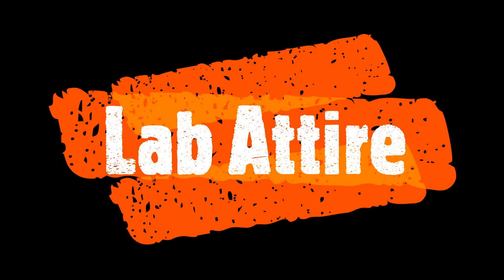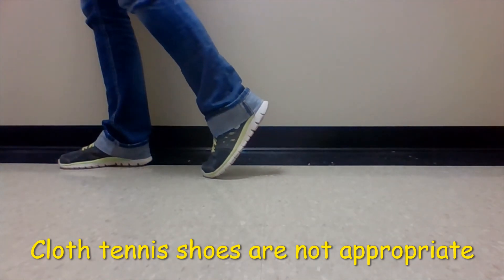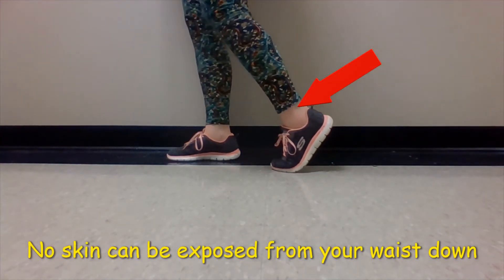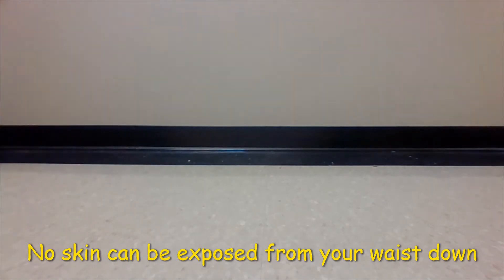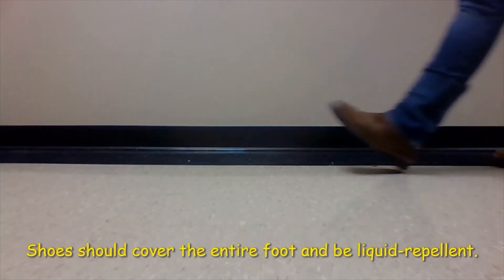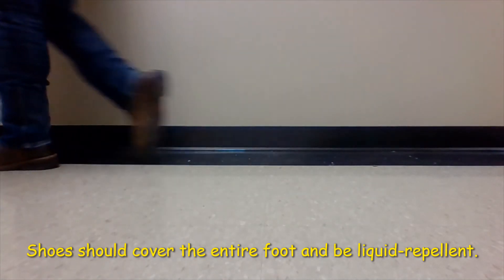Now let's talk about proper lab attire. Cloth tennis shoes are not appropriate for the laboratory. You also shouldn't have skin showing from your waist down, including your feet, your ankles, and any holes in your pants.